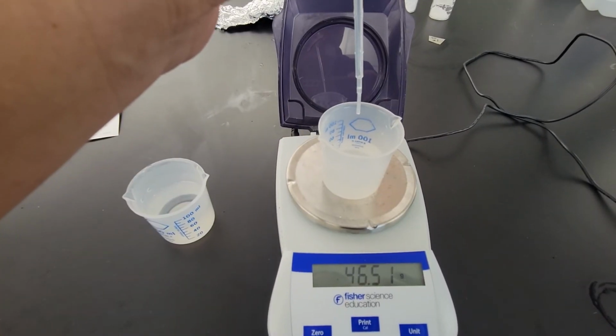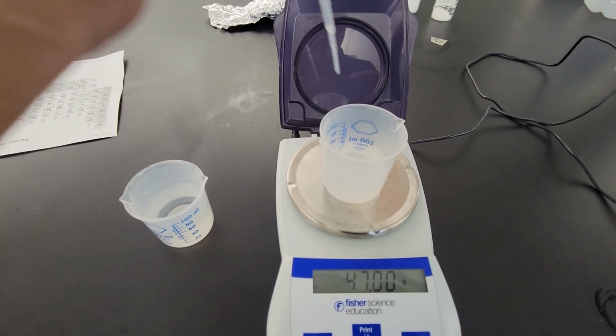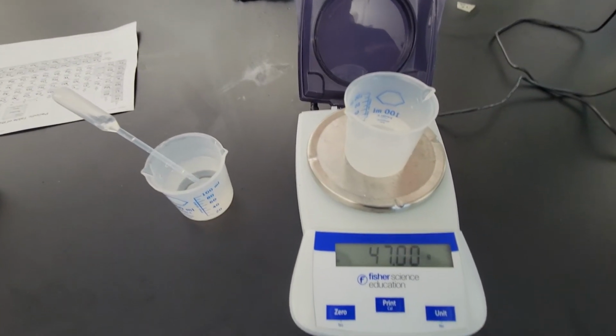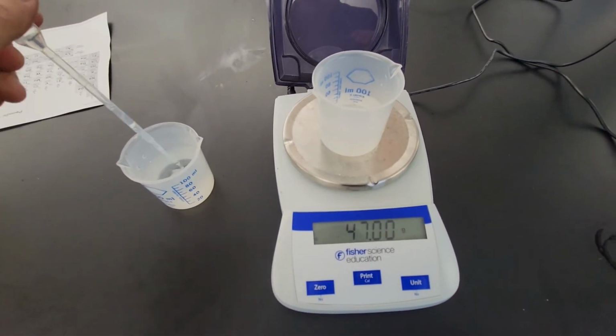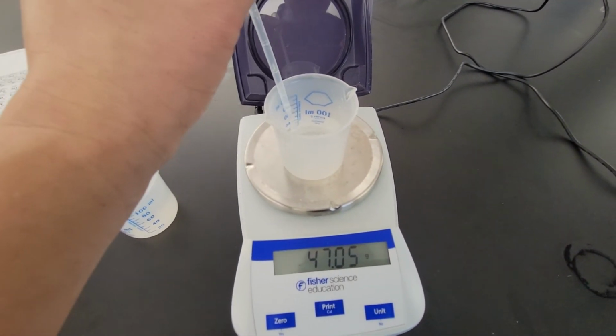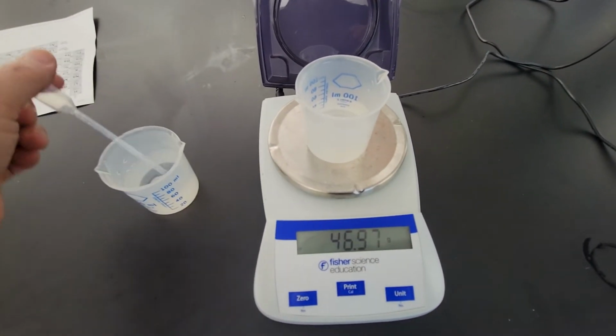That would work. Yeah? Yeah. Just one pass. Like, don't do it multiple times. Just pass. Okay, I'll try. And that'll be close enough. I'll do it once with 46.97 is what we're looking for. I have much trust in you. Ooh. If you mess up, it's my fault. Good. So.